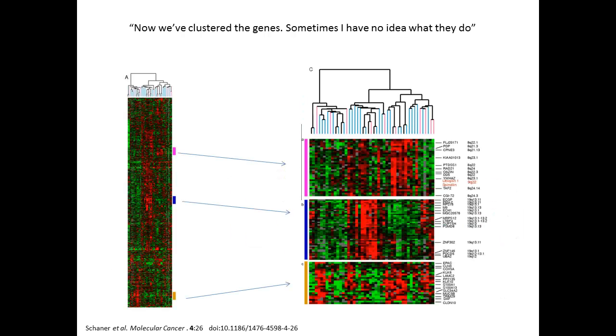So now let's say you've completed that analysis and you've clustered the genes and you've clustered the conditions as indicated by the dendrogram here at the top. You can tell you've clustered by the genes. You see these stripes of similarly behaving genes. And then these authors in this particular paper have picked out 3 different regions which are blown up here. You can convince yourself of that. Here we have sort of a green, then a red patch, then green, green, red patch, then green.